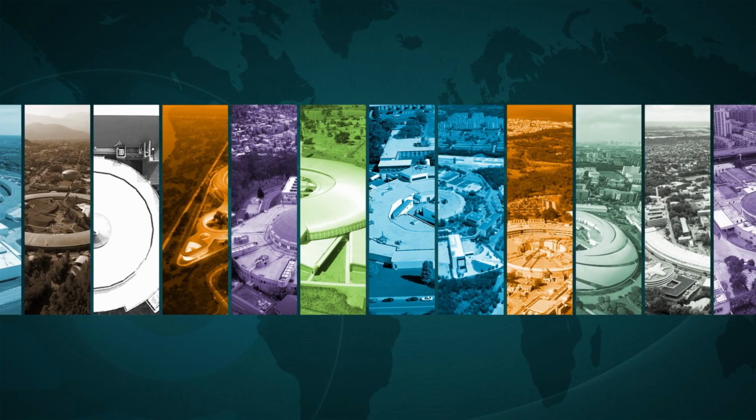There are many ways X-ray crystallography methods can be used to solve the structure of repeating units in our crystal. X-ray diffractometers and synchrotrons are used for large and medium-sized crystals. But if your crystals are too small for these methods, say about a micrometer in size, about 1/10 the width of a human hair, we can illuminate the crystal with an electron beam. After a few minor corrections in parameters, since electron wavelengths are much smaller than X-ray wavelengths, for example, we can then process this diffraction data just like we would data from XRD or synchrotrons.